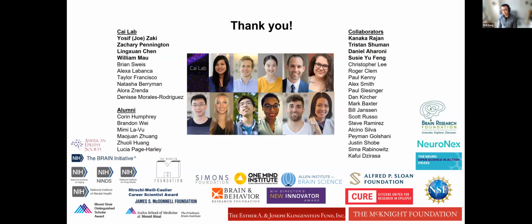I think one of our lab members is about to try that, exactly because of the difficulty in registering cells across sessions. Maybe it's easier to basically cheat the algorithm and tell it to handle everything as a single recording session. So yeah, it's possible at least, and I'd love to hear if anyone has tried that.